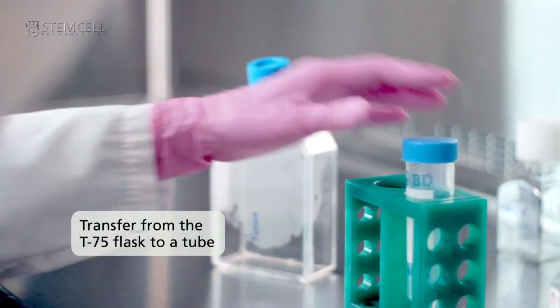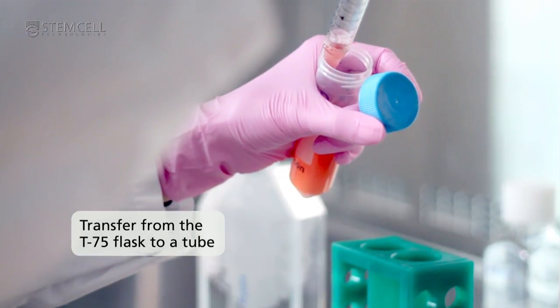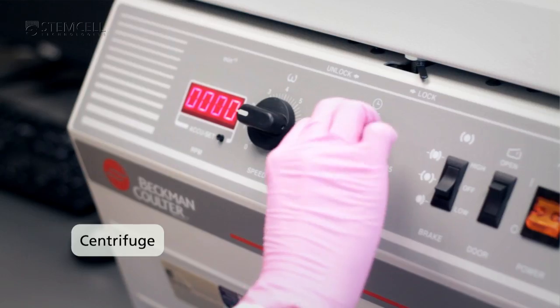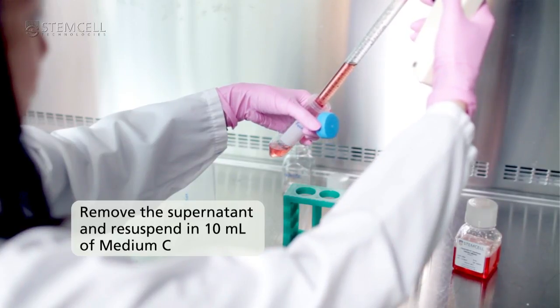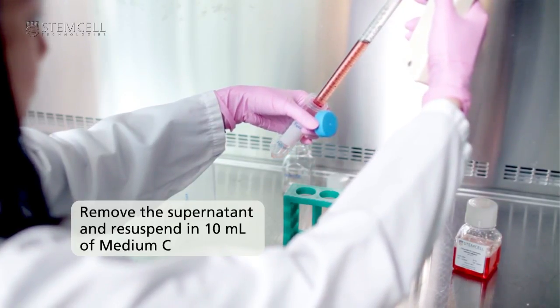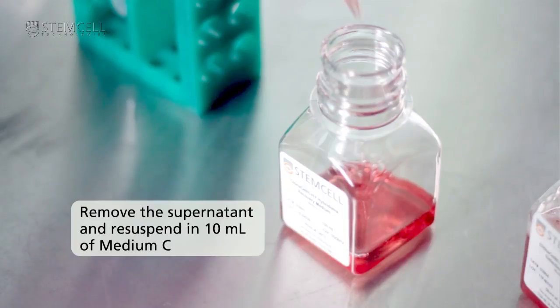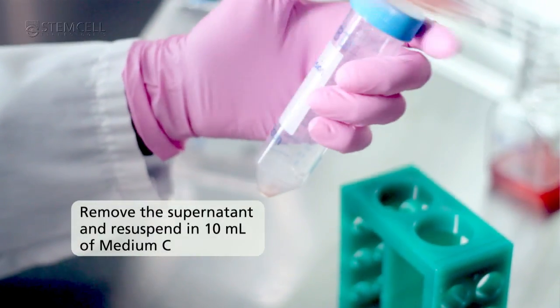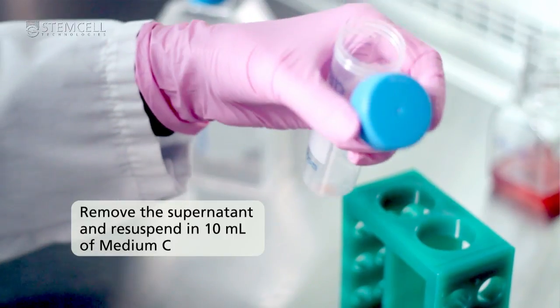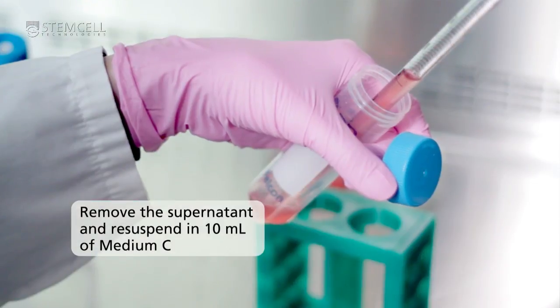Transfer the fused cells from the T75 flask to a tube. Remove the supernatant and resuspend in 10 mils of medium C. Do not exceed a volume of 10 mils at this step. Using too much or too little liquid medium will affect the viscosity of the semi-solid medium D and the growth of the colonies.